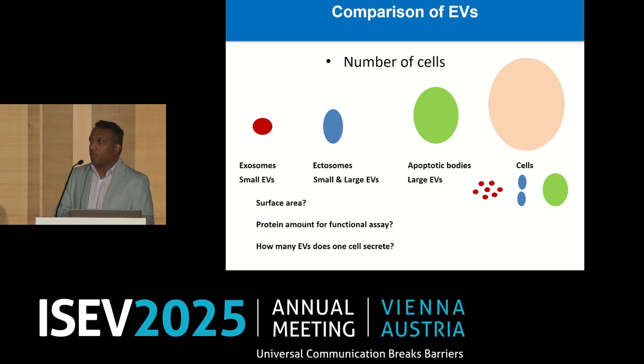But when you're doing an EV prep, which has a larger membrane compared to your cell, given the size, you would relatively get more membrane proteins identified. So in our hands, we can identify 30% membrane proteins in an EV prep versus 10% in your whole cell lysate, right? It just shows EVs naturally have more membrane proteins, because of the amount of protein that you work with.